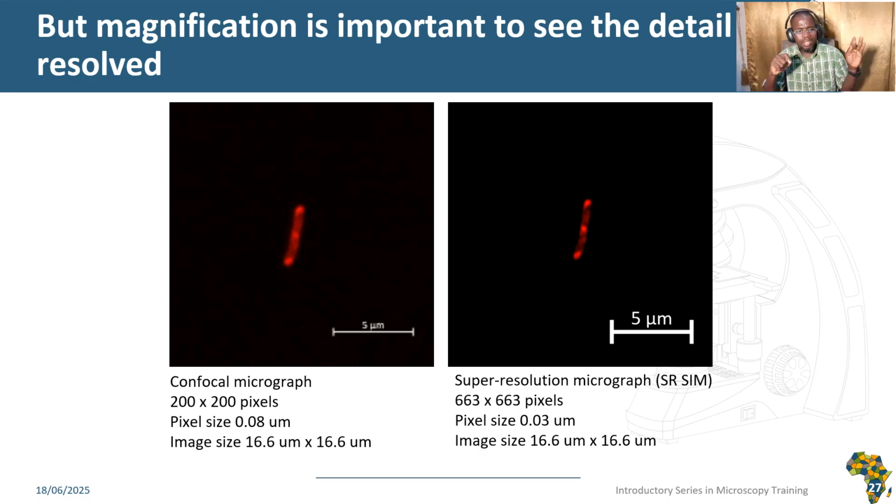As you can see here in the diagram, this is clearly magnified but poorly resolved. On the other hand, the three dotted points are clearly enlarged and clearly seen.